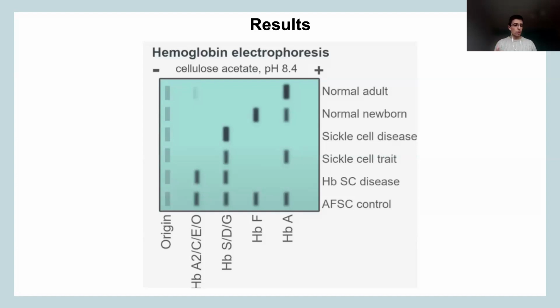that you have. It is not uncommon that that control might be run multiple times depending on the size of the gel. Sometimes gels are quite limited in how many samples you can run within a gel, especially the ones commercially available. But if you made your own gels, depending on how many wells you have created on your own gel, this might be a good idea to insert controls maybe in the beginning, middle, and the end, or just two of them in the beginning and the end, because it's quite nice to have that ruler. So to give you assurance that all the bands are running where they should.